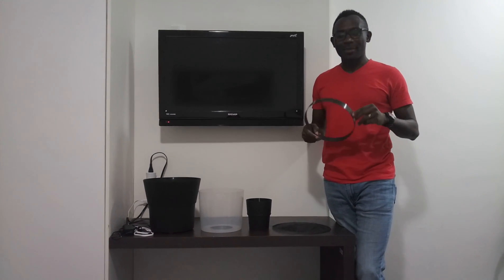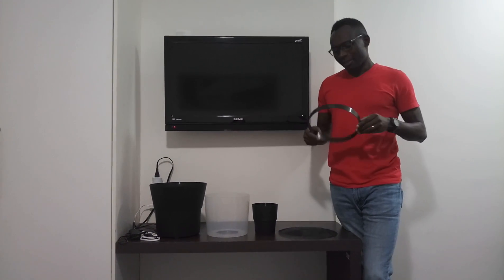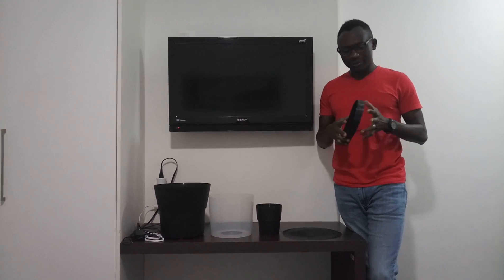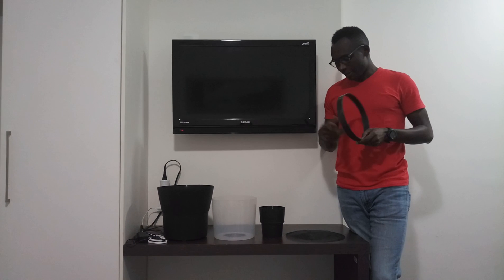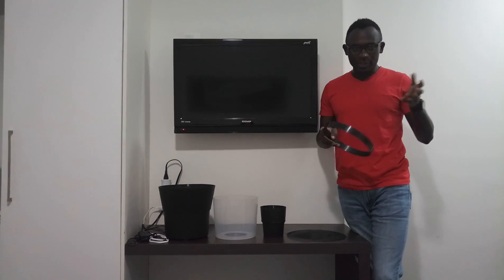I'm going to show you how to put together the GUT trap. The GUT trap means the gravid Aedes trap, originally developed in Australia by Professor Alvaro Eros together with Scott Ritchie. The very original publication was in the Journal of Medical Entomology in 2014.